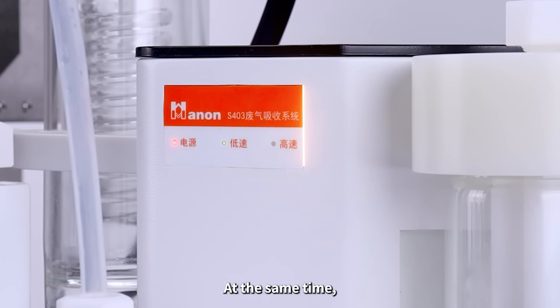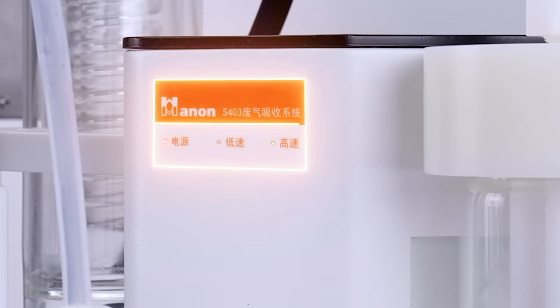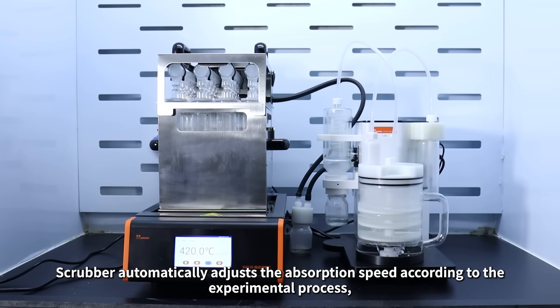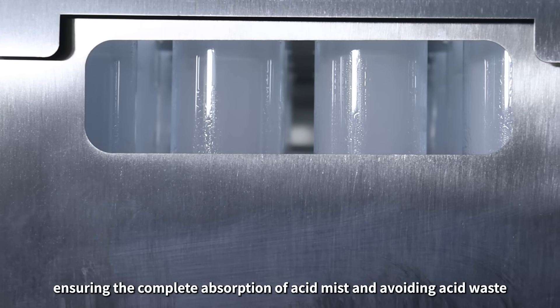At the same time, the exhaust gas absorption device is started by the digester. The scrubber automatically adjusts the absorption speed according to the experimental process, ensuring complete absorption of acid mist and avoiding acid waste.